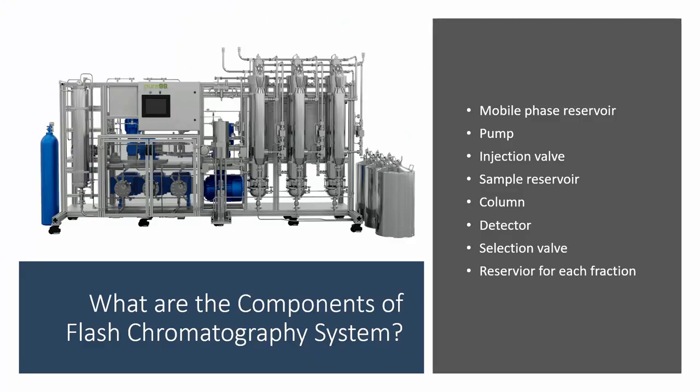Holy stainless steel, Batman. Look at that. It's got a lot of stainless. In reality, these parts right here are insulated because they're warm and cold. But that's essentially what the Pure 99 looks like. We just took that off.